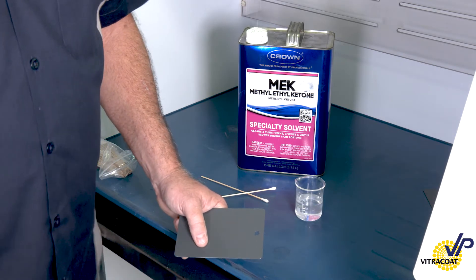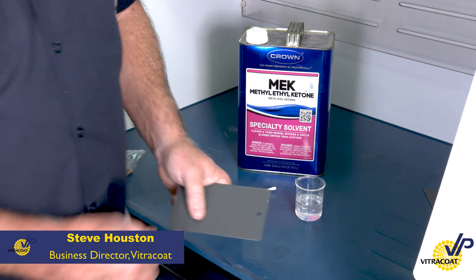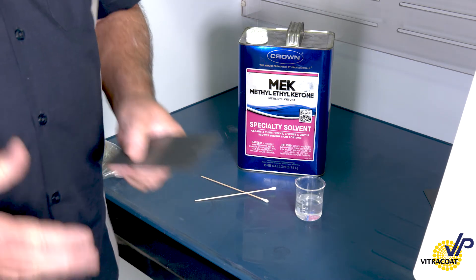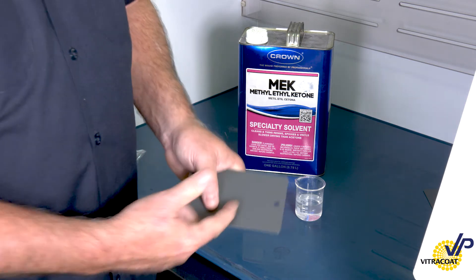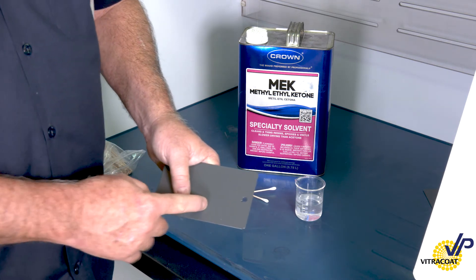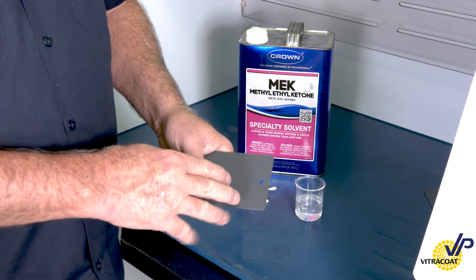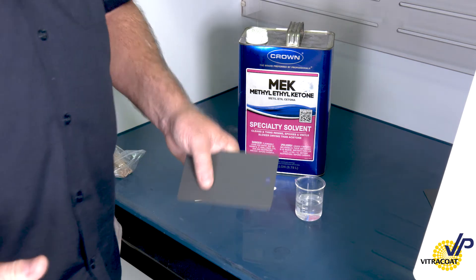One way to evaluate cure in the field is to evaluate the solvent resistance of the coating itself. The only way to really understand if it's cured or not is to compare a finished product with a known cure. This particular panel was sprayed in the Vitrico Innovation Research Center at the recommended cure parameters, and we know that it's cured. What I want to do is compare the solvent resistance of this panel to my finished product.